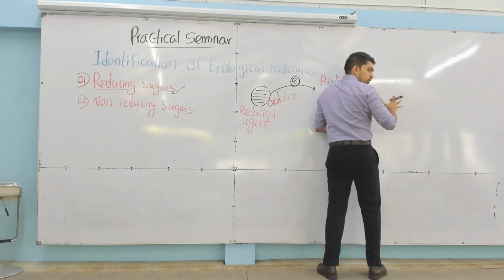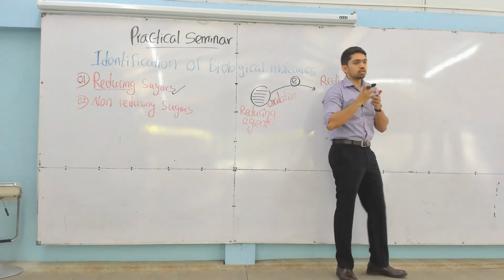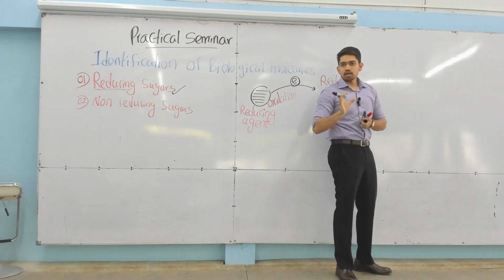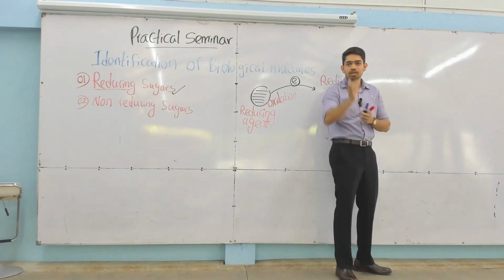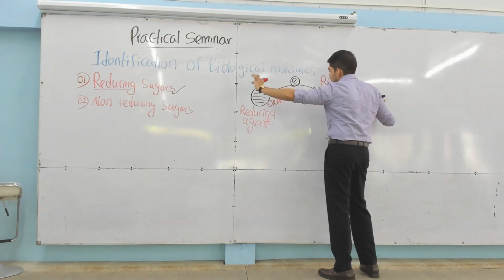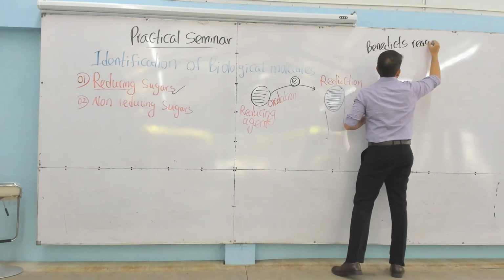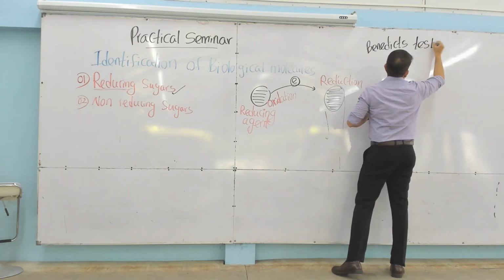The reagent, right? For any chemical reaction in biology, we use a preformed chemical, what we call a reagent. Okay? So it's a preformed chemical substance that we can use to get a textbook result using a certain reagent. If you follow these steps, you should get a well documented result. It should come out like this, that is the theory. So the test that we use to identify a reducing sugar is the Benedict's test, done using Benedict's reagent. Okay? So we call it the Benedict's test.